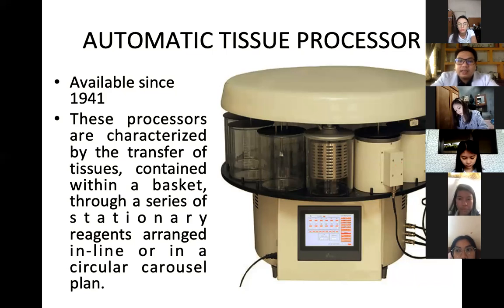Okay? So, paano? Paano ba siya gumagalaw? So, circular motion, clockwise. Pero dapat yung reagent niya, class, tama din ang pagka-position. Okay? So, naka-time siya to transfer a specimen from one container to another.